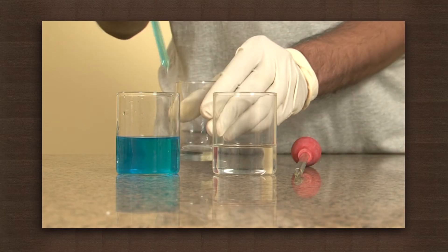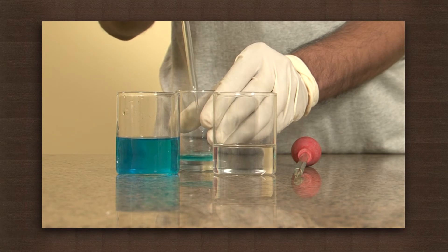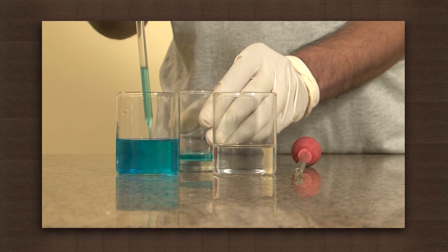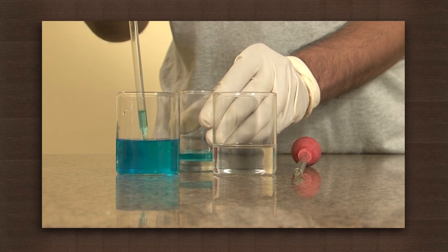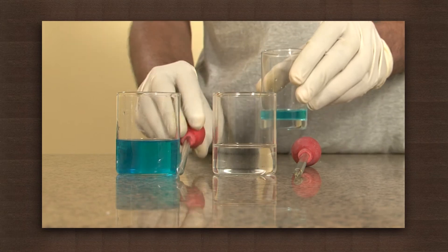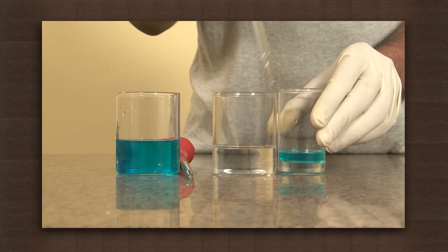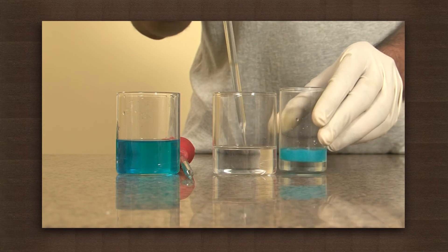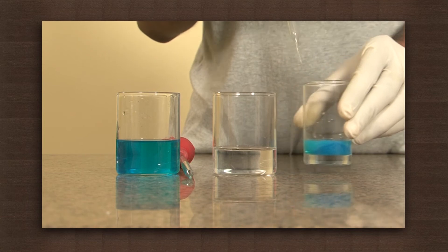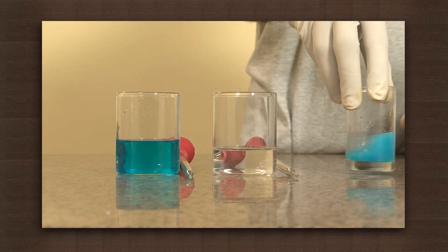Take 5 milliliters of copper sulfate in a beaker. Add 3 milliliters of sodium hydroxide in the beaker, and shake the beaker for about 2 to 3 minutes. Observe the color of the solution.